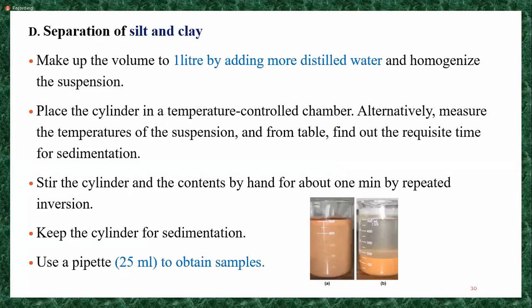Then for the separation of silt and clay, you have to add more water to homogenize the suspension. And you have to observe the sedimentation.